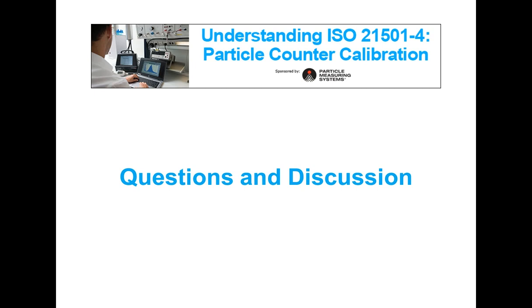Of course, an instrument that works 24 hours a day is different from an instrument working 1 hour a week. So I would say that instruments normally work for 10, 12, 15 years without any problem, with, of course, annual calibration, normal maintenance, and normal part replacement when they break.